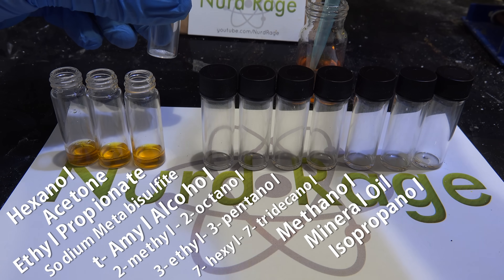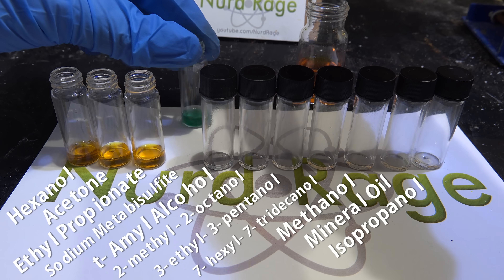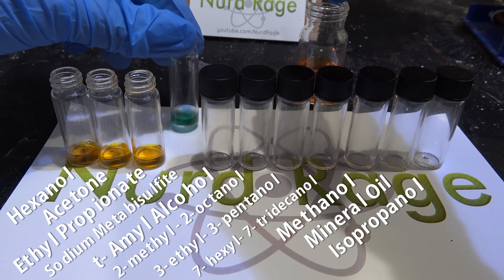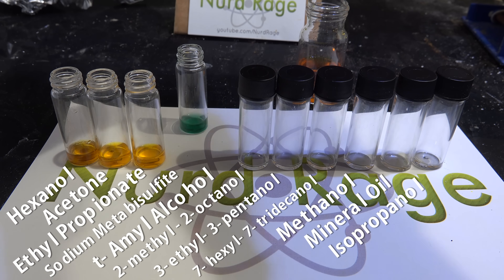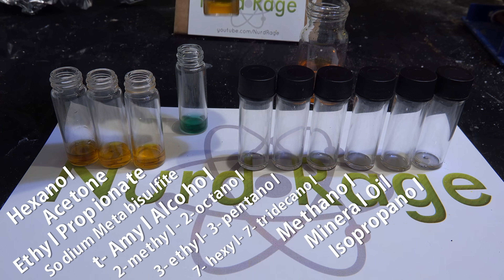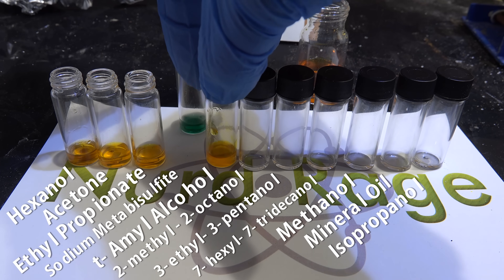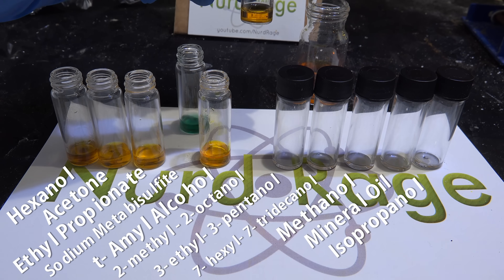So how does this help us determine the purity of a compound? If the compound itself doesn't react, then the dichromate test should remain orange. But if there is a color change, that means the compound is impure, or it might not even be the desired compound at all. Likewise, if the compound normally does react but the test comes up negative, then you definitely know you don't have the right compound.